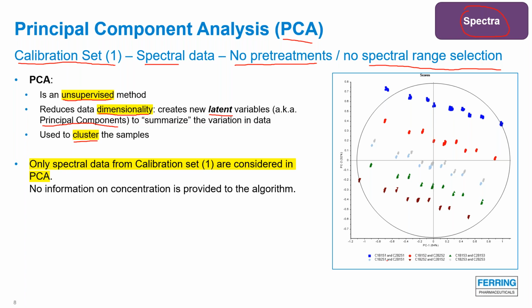And I've colored them according to the replicates. So as you remember, we have 6 stock solution and we combine them randomly between the API and the preservative. And therefore we have 6 different combinations. What we can see is that these new coordinates, which are PC1 and PC2, are actually describing 64% and 32% of the variation we have in the spectra.